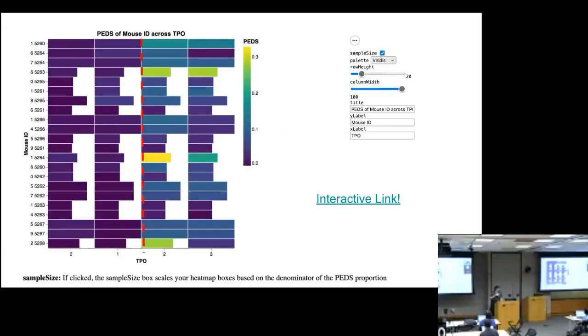All right. My next one is a method by Aguala et al. and it's called proportional engraftment of donor strains. And it kind of is what it sounds like. They're looking at how many donor strains a sample received from their donor, and then how many of them they actually successfully engrafted. And so same study here.